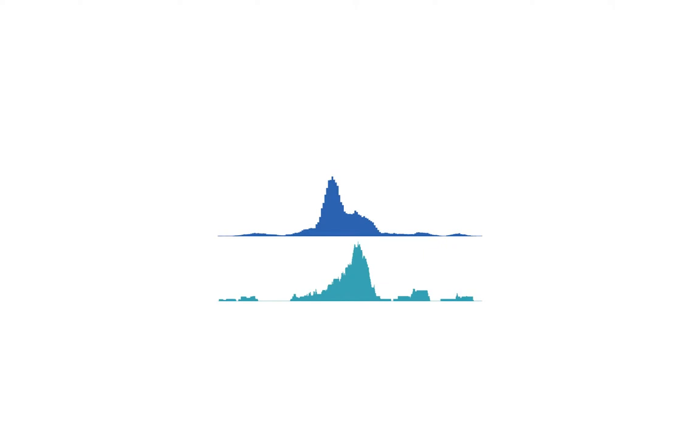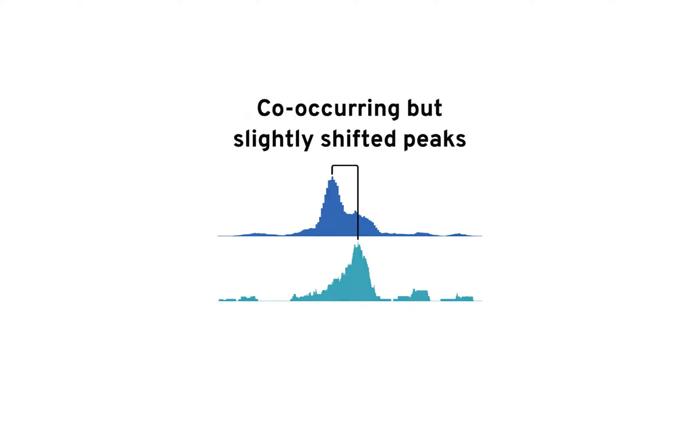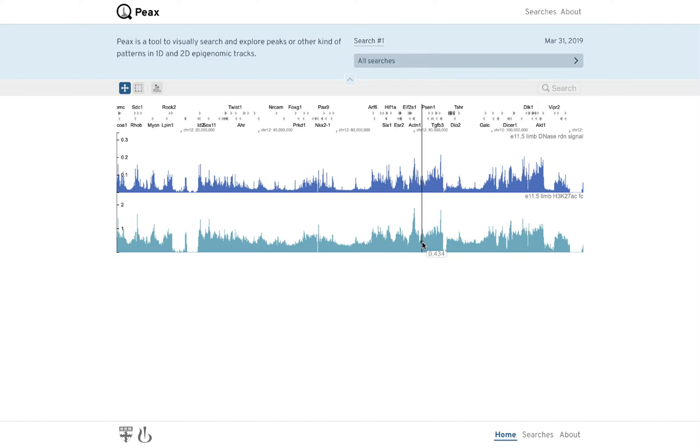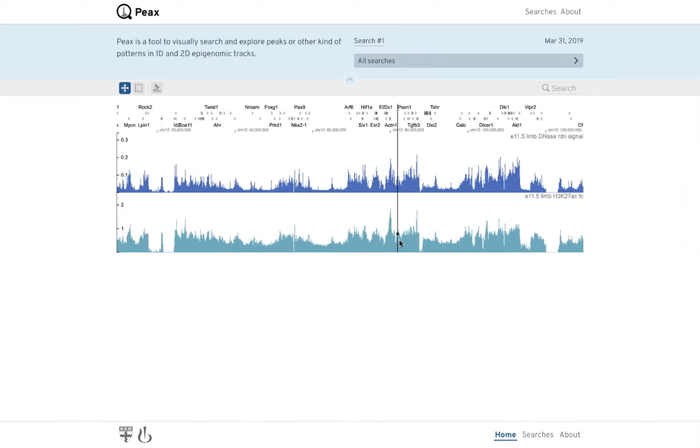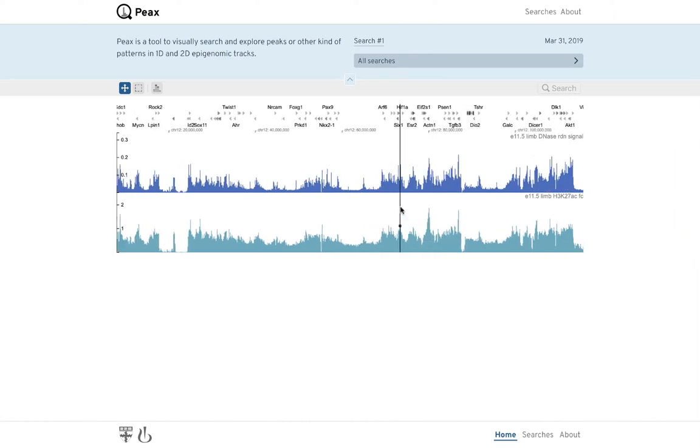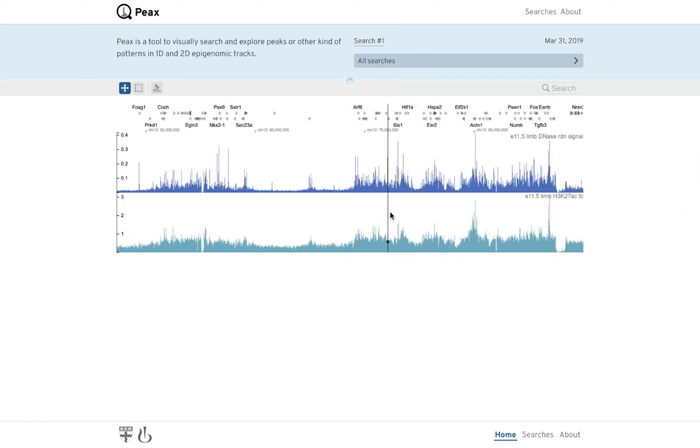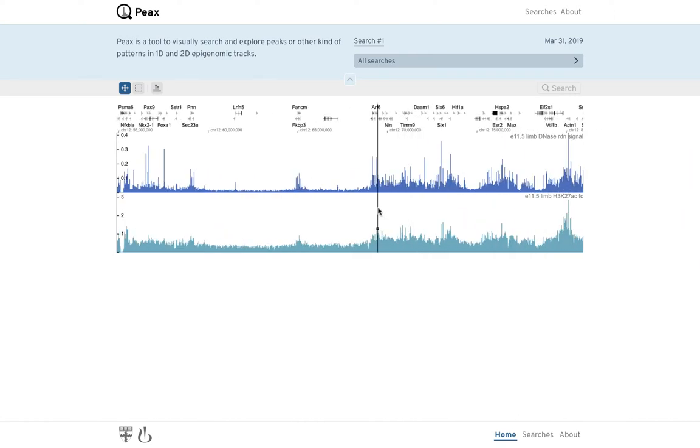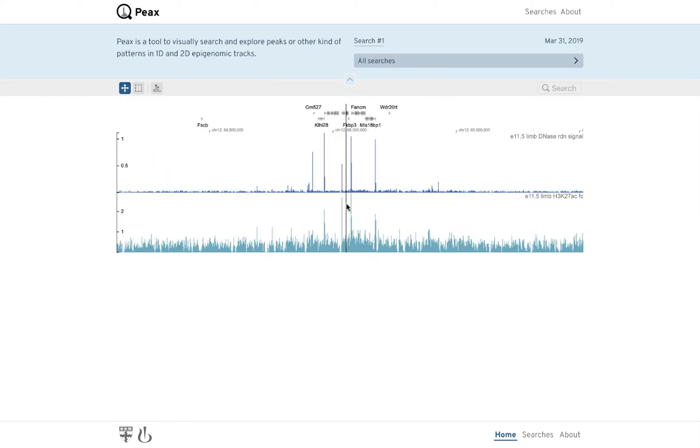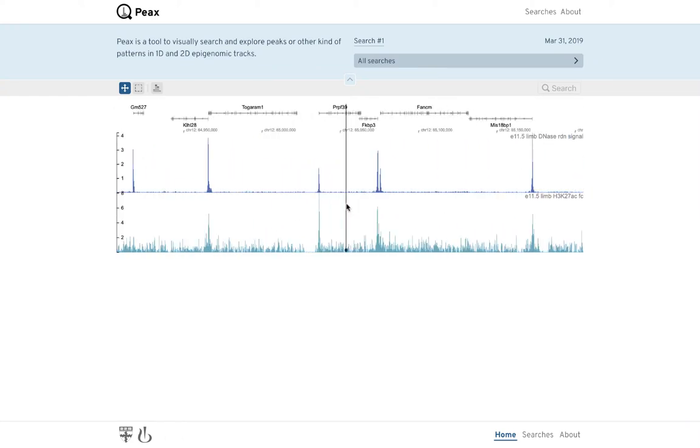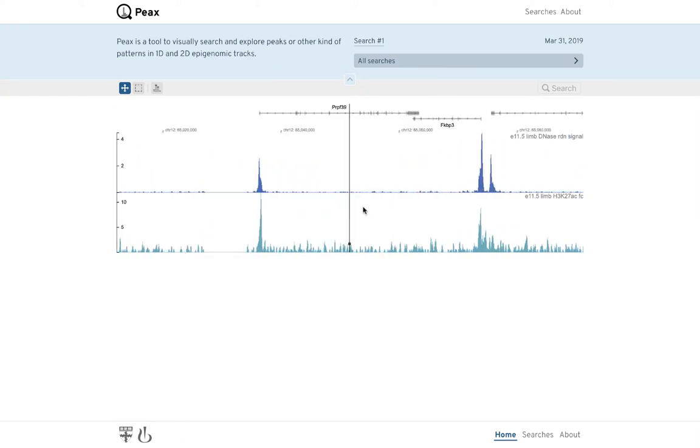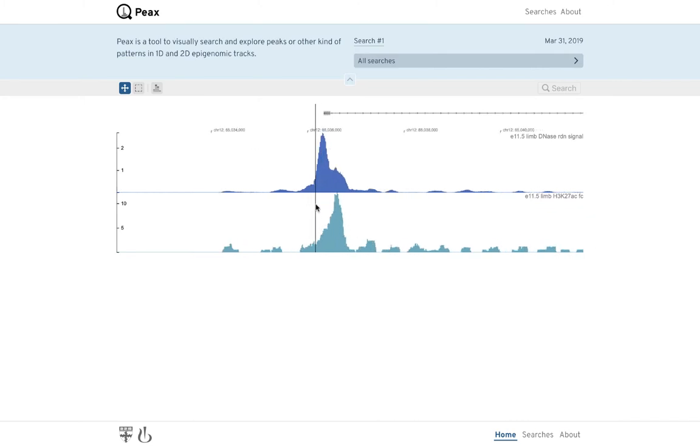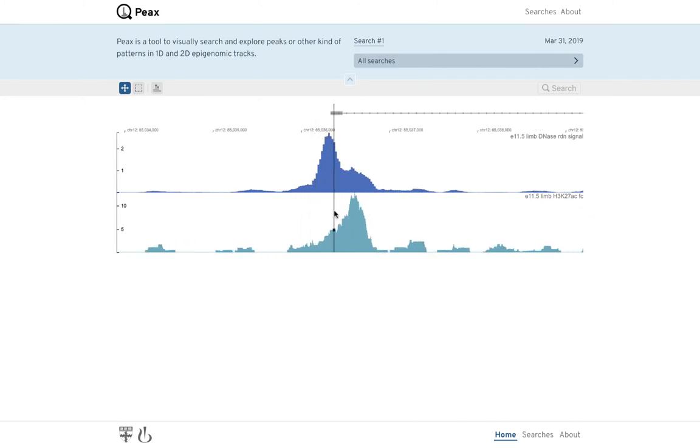In the following, we demonstrate how Peax can be used to build a classifier for co-occurring but slightly shifted peak-like patterns. We start at the landing page, which shows two bar charts that visualize some property of the mouse genome. We begin by browsing to find regions showing slightly shifted peaks and select a good example by brushing to start the search.